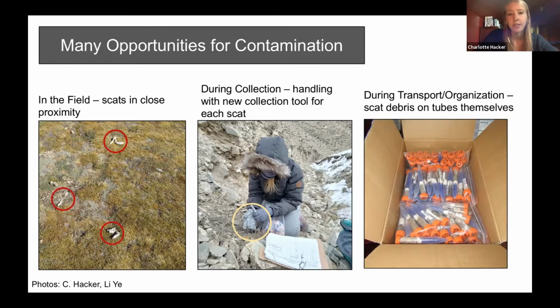During collection, you need to treat every scat sample as an independent sampling event. So you want to make sure that you're using a new collection tool every single time. You don't want to be repeating, for example, if you have gloves, you want to change a glove every time. If you're using tweezers, you need to change tweezers every time or sterilize them. So you want to make sure that you're not accidentally transferring DNA from one scat to the next scat that you collect. And when you're collecting 100 scats a day, this gets to be a little bit tedious. And sometimes when you're tired, it's important that you're keeping track of the steps while you're collecting to make sure you're practicing proper sample etiquette and collecting with the fresh collection tools as part of that.